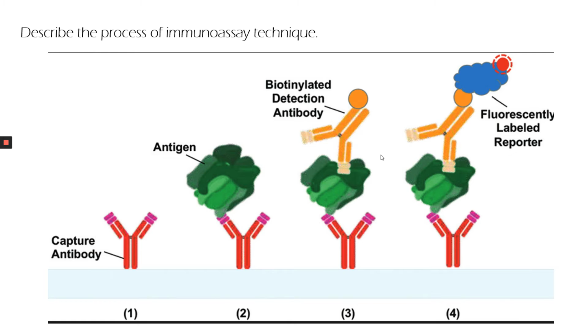In immunoassay techniques, an antibody specific to the type of protein antigen we're looking for is linked to a chemical label. This label is often a reporter enzyme, which will produce a color change when bound to, but chemiluminescence and fluorescence and other types of reporters can be used as well. In some cases, the assay will use a specific antigen to find the presence of an antibody instead.